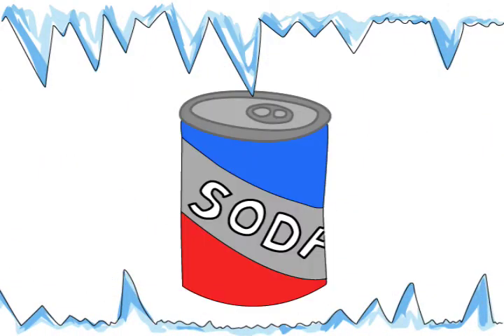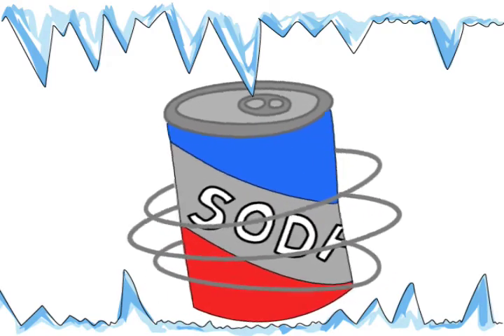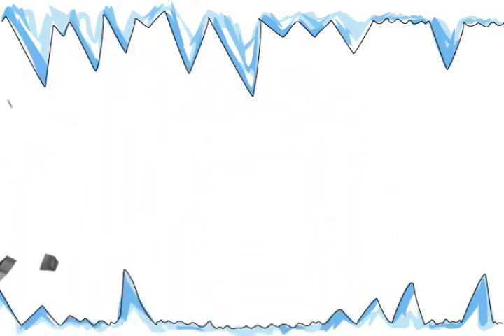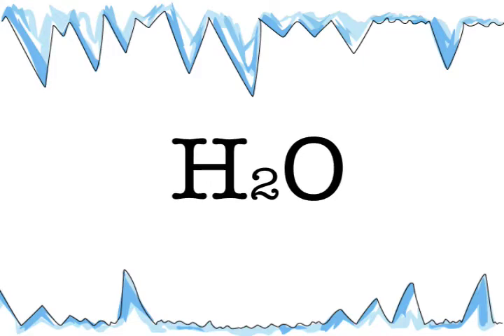This reaction is similar to when a soda can is put into a freezer. When a soda can is frozen, the contents inside the can expand and will eventually burst. Both the soda can and the cell contain water, and water expands when frozen.